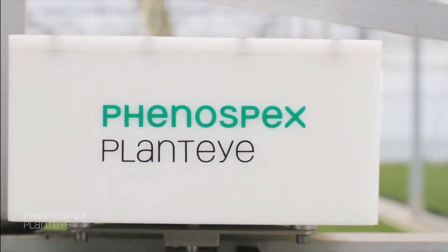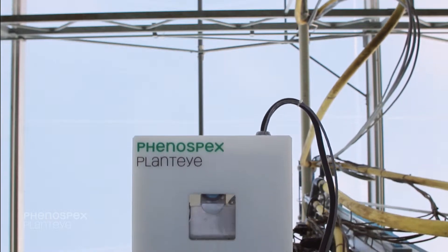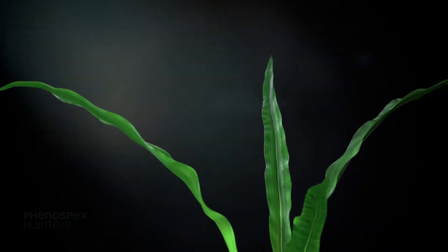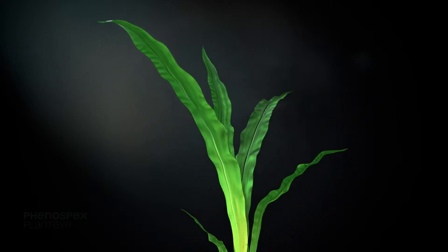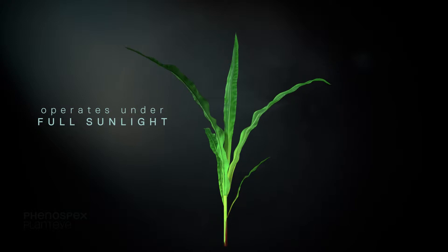Phenospex PlantEye is a new generation 3D laser scanner specifically designed to measure plants at high throughput in harsh environments. It's robust and reliable and can be operated under full sunlight.